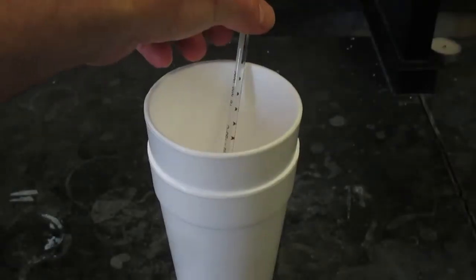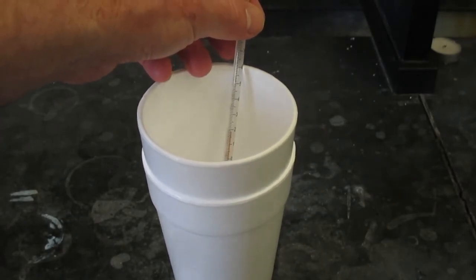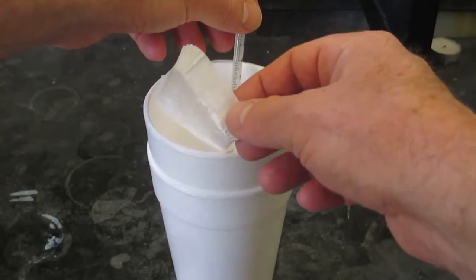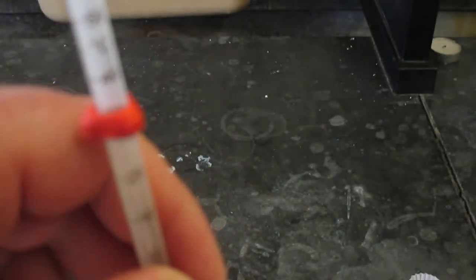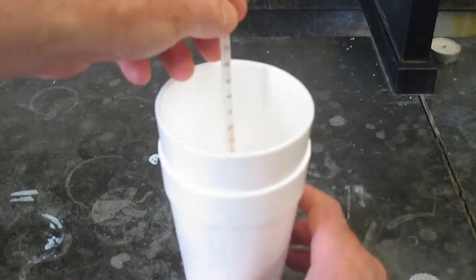What I have here is the HCl solution we just got done massing, and the temperature of this HCl solution is once again 18 degrees Celsius. I'm now going to add the magnesium oxide to the solution. If you listen very carefully, you can kind of hear just a little bit.